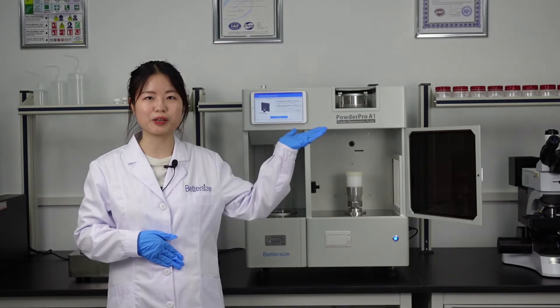In the last video, we measured the bulk density of a non-metallic powder. This time, we are going to investigate the tap density with a fixed volumetric method using the PowderPro A1.